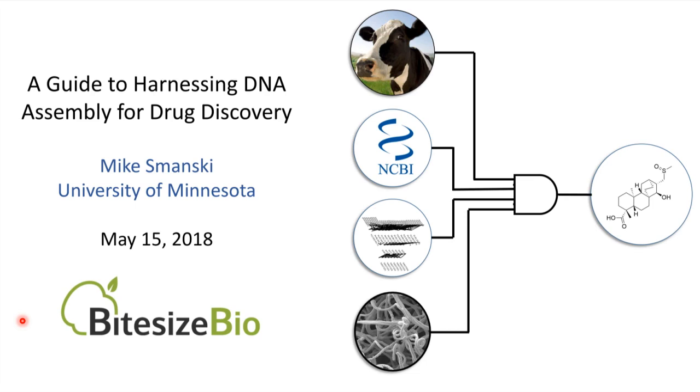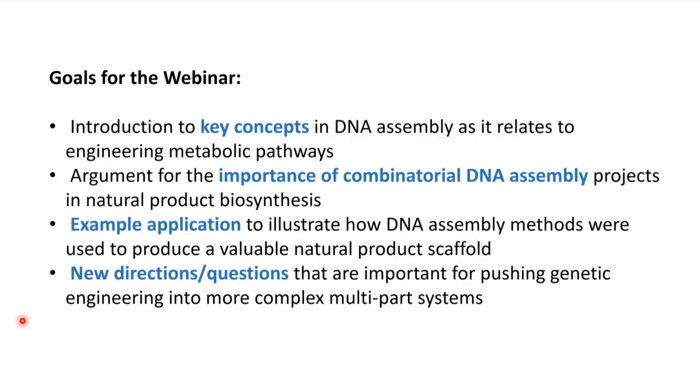The goals for the webinar today are laid out on this slide. The goal is not to get too much into the details of DNA assembly protocols or methods, but more to give a 30,000-foot view of what it means when we talk about DNA assembly, how we use it for drug discovery and drug development efforts, and some of the newer questions that my group is asking in the field.